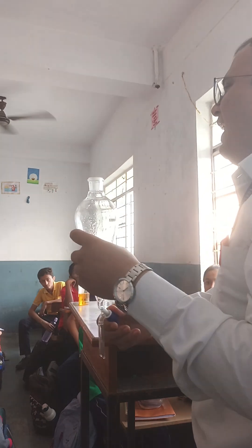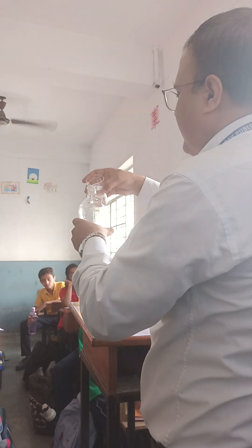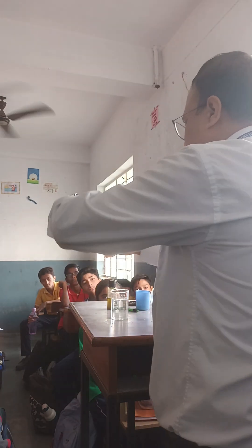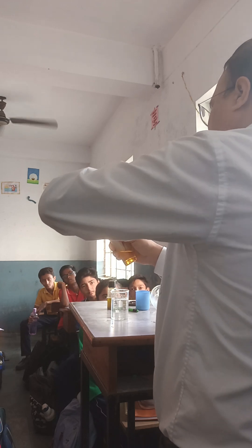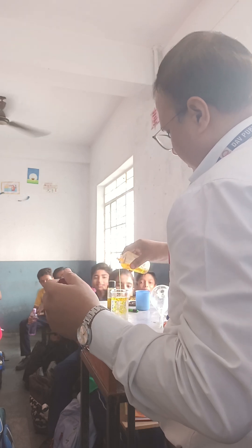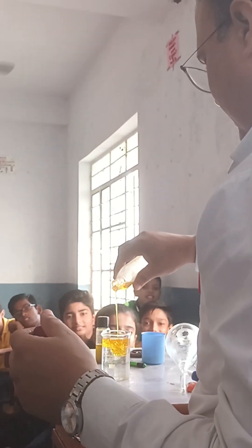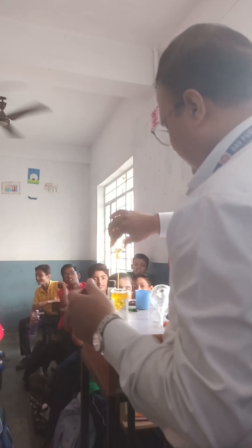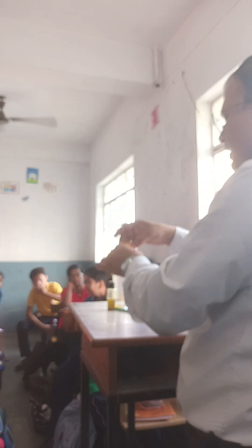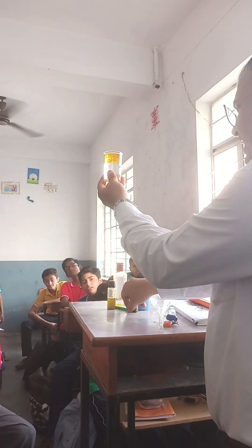Now we have to mix mustard oil and water. So put the water and we mix here. Look at this — this is a mixture of mustard oil and water.